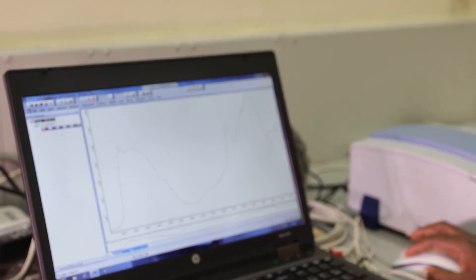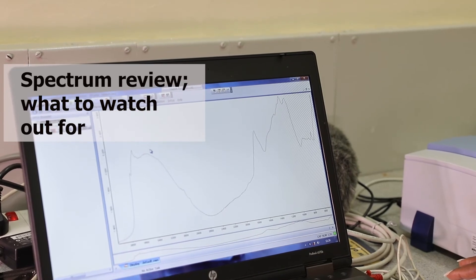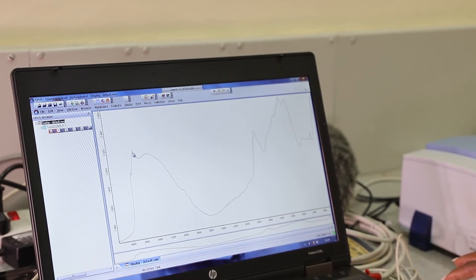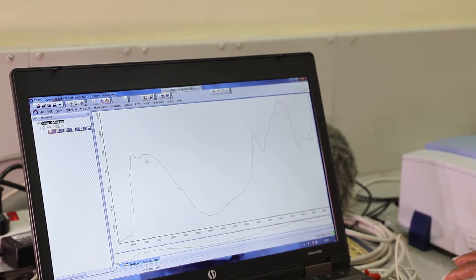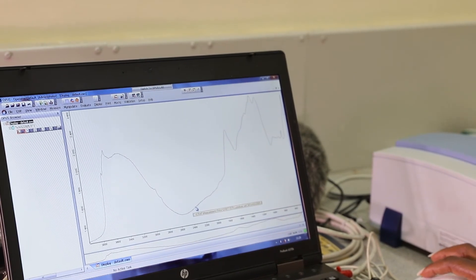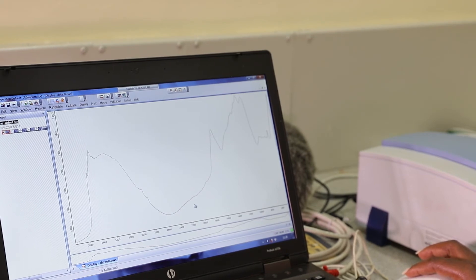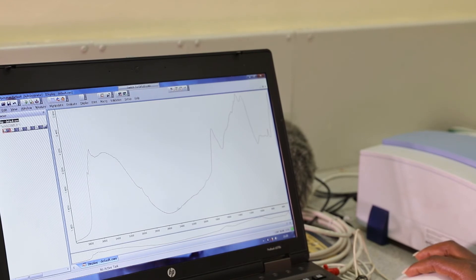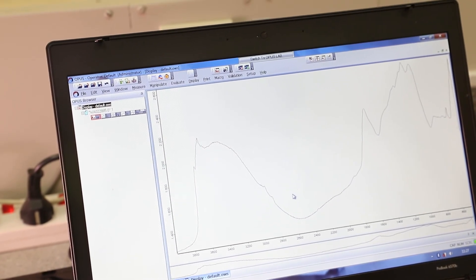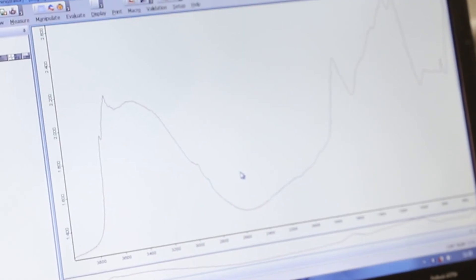After 30 seconds, we have our spectra here. As you can see, this is a good spectra. We highly recommend you review your spectra before further processing, to help monitor water moisture — which is normally at 3,960 to 3,480 cm⁻¹ wave band and 500 cm⁻¹ wave band — and also CO2, carbon dioxide, which is around 2,361 to 2,339 cm⁻¹. As part of quality control, the spectra data generated from the instrument are saved and processed further using shared C4 ECRAFT spectral processing and analysis tools and methods.